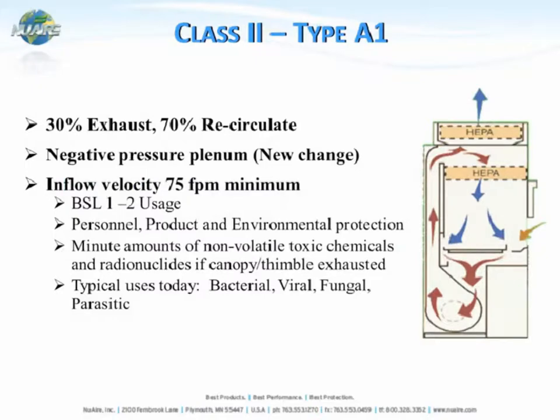Moving on from Class I, we get into the first portion of Class II cabinets: the Class II Type A1 biological safety cabinet. This cabinet functions with 30% of the airflow exhausted either back into the laboratory space or connected to the exhaust system, and 70% of the airflow is recirculated within the cabinet through HEPA filtration. The airflow velocity on the Class II Type A1 is 75 feet per minute, and the BSL level usage for an A1 cabinet is either BSL level 1 or 2.